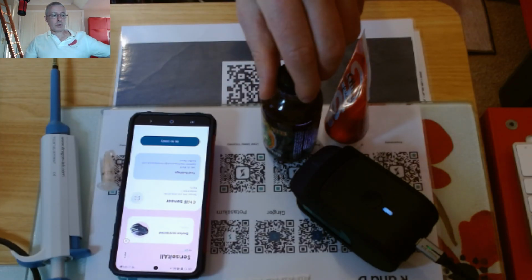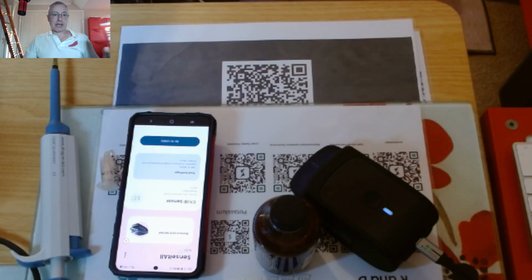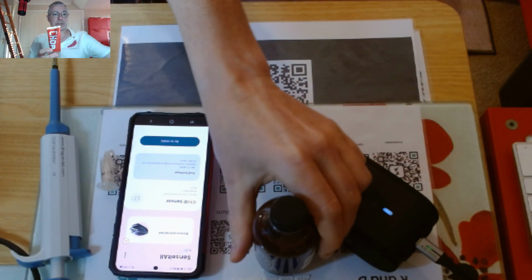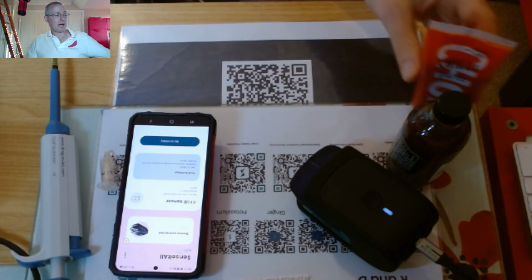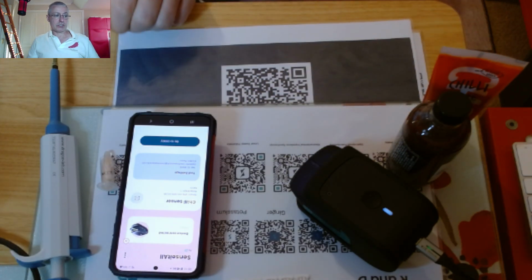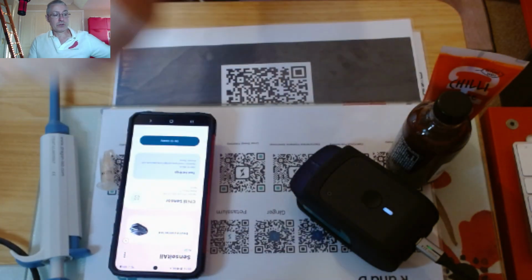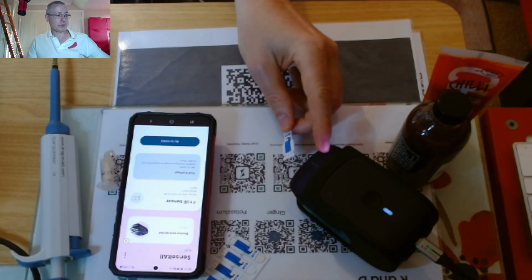In this video I'm going to talk about how to share data through Julie. In this particular case I'm imagining that you're a FoodSense Generation 4 user and that you've been gathering some data on the FoodSense Generation 4, and now you want to actually share some data with us.